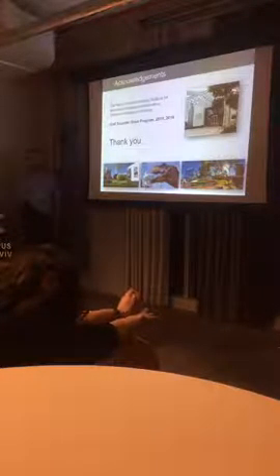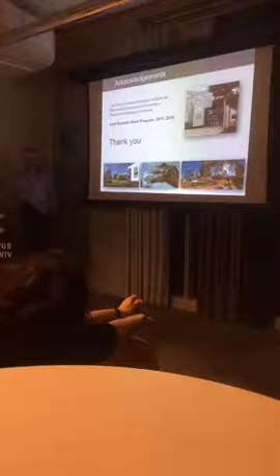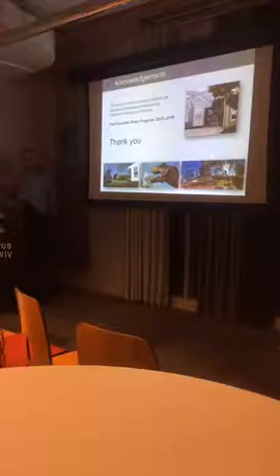It's better to use web cameras, where you can control the exposure time. Also, with such a camera you have colors, which reduce your resolution. But it's not a problem if you are limited with money, because you still can get a good, high quality image on a standard color web camera. Of course, there are some black and white cameras that could be more preferable, but not necessarily.